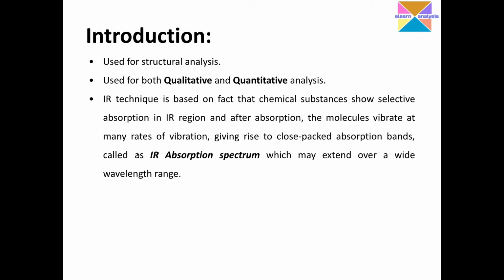We call these absorption bands the IR absorption spectrum, and this may extend over a wide wavelength range.